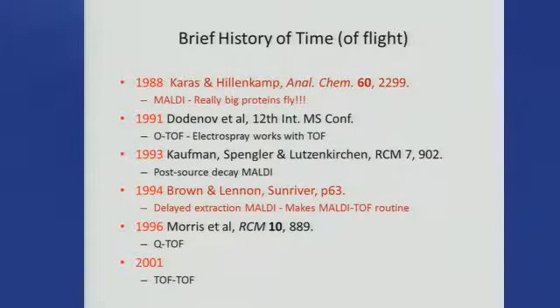So we started working on it. Raymond Kaufman was mentioned earlier, and he and Spengler were the ones that pointed out that because the ions were fragmenting in flight, you could analyze these to get fragmentation, and they were doing this quite early in the MALDI period.